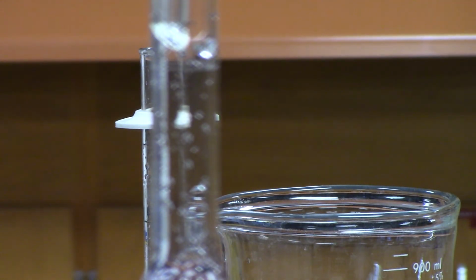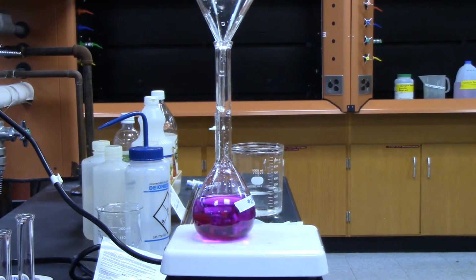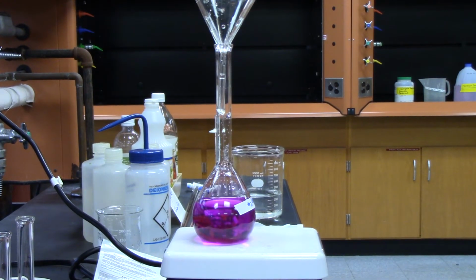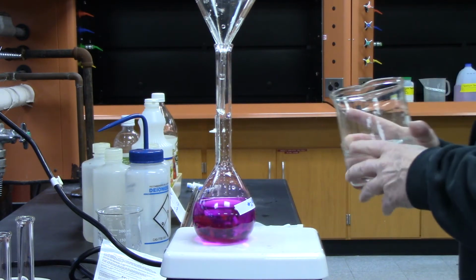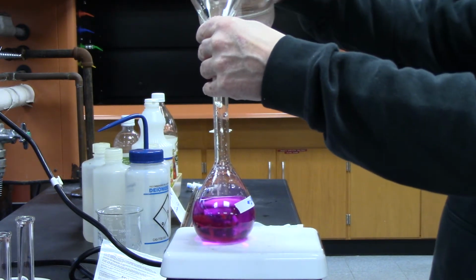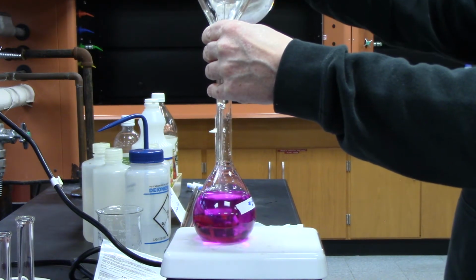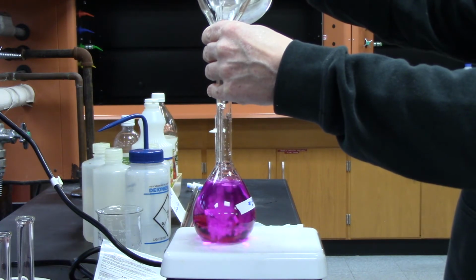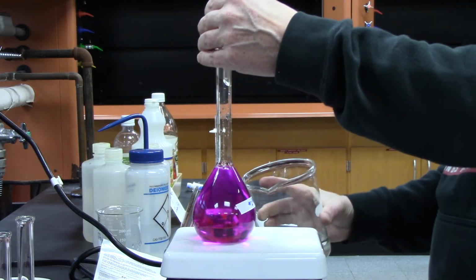Alright, so there you go. So now I have to bring it up to my line. Sorry I didn't change the viewpoint of that, but basically I went through all of that the same way I did before. Now I want to bring it up to 250. I'm going to use my stock water. Again, I'm going to be careful that I don't overfill it, just to the bottom of the neck. Got to be careful there.